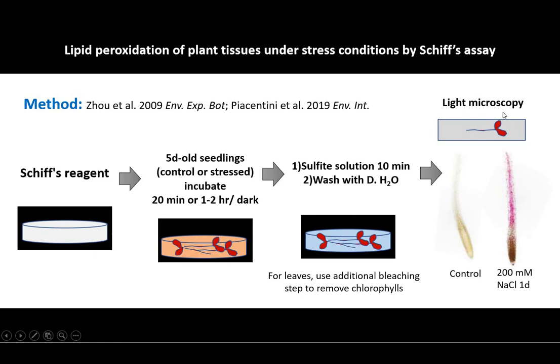Under light microscopy, this is how it looks. These are the control roots and these are roots that are under stress like sodium chloride treatments. The presence of lipid peroxidation is indicated by the magenta color regions. Good luck.